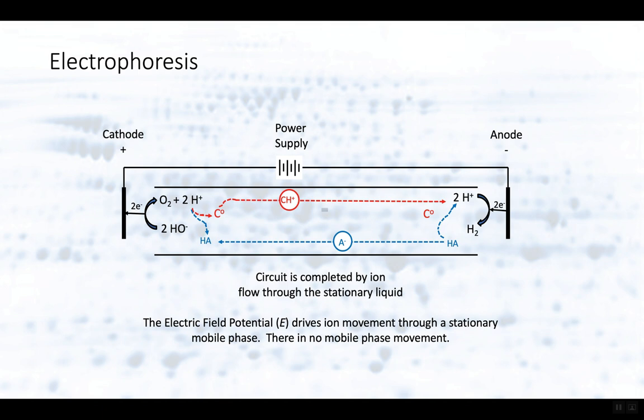So when it does that, the proton accepts an electron from the anode, and we get two electrons jump on, and we produce hydrogen. So when electrical circuits run in an aqueous system, we're always producing oxygen and hydrogen gases. This is how we separate gases and produce hydrogen from seawater.